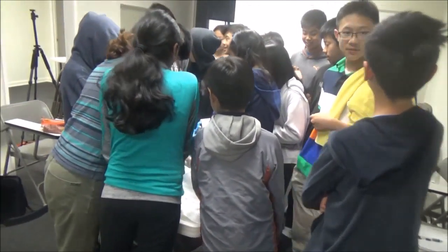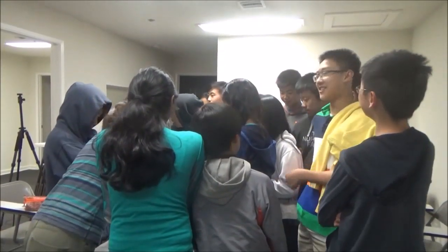Last year when we were dissecting a squid, we just dropped the scalpel and put it back in the drain like nothing happened, and we just continued.